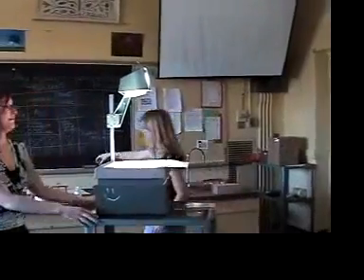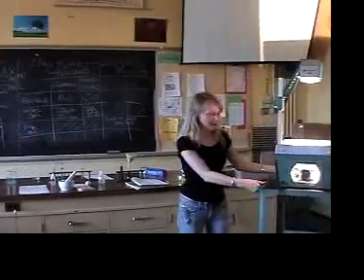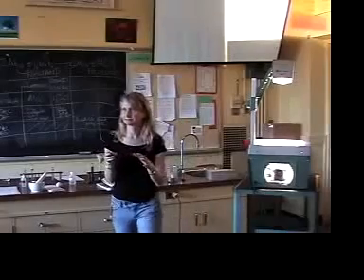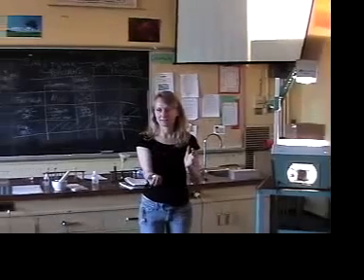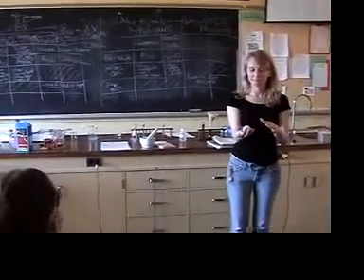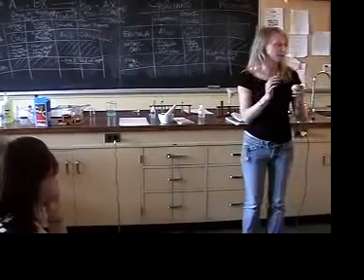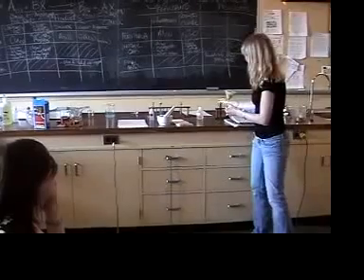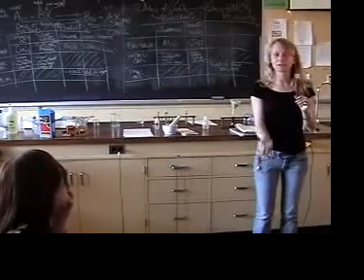Okay, so what we're seeing is red, but then green over here. Let's try and think about why we would be seeing red. What did I talk about before? In the cell, the light energy comes in and gives the electron more energy, and in the cell that energy will be used to make ATP. But in this example, the chlorophyll is by itself. It's not in the cell. So what's going to happen when the electron comes back down?